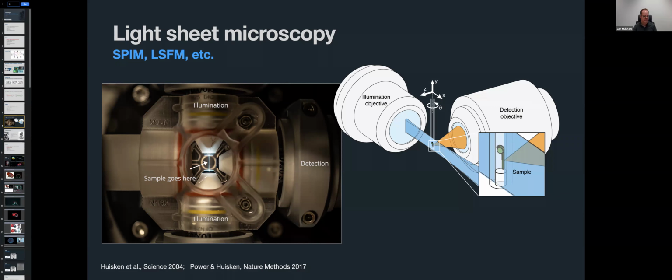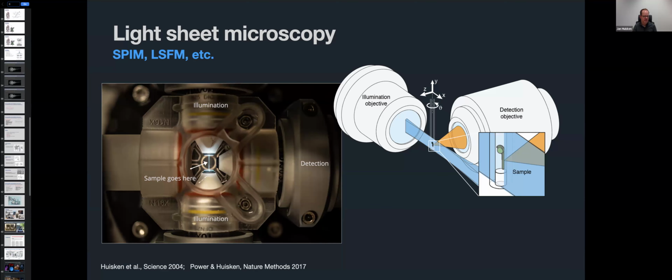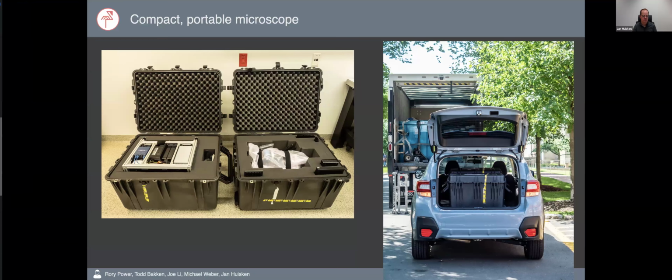Yeah, it's actually relatively straightforward. And to our surprise, there haven't really been any major issues. So essentially, when you get a Flamingo, you have to unpack the microscope from its box, put it on a sturdy table, like a bench in a wet lab would even be good enough. It doesn't need to be an optical table.